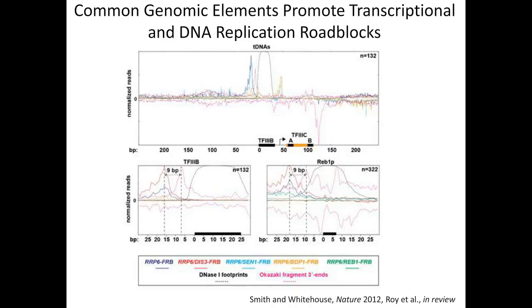So if you want more subtle changes, such as 2-fold or less, you will need to have multiple replicates and utilize some statistics to determine that the changes you're seeing are significant. We did not need to employ that kind of statistics in this study because we set such a stringent cutoff.